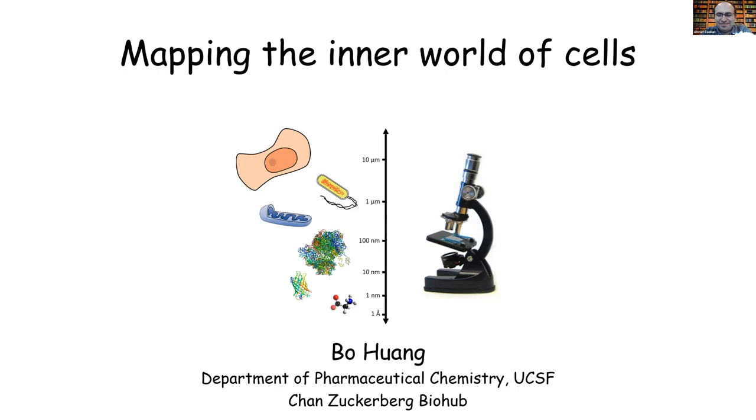That would be exciting. I actually have a number of questions, and the first one is related to what Ame asked. How do we do multiplexing? I'm thinking it's probably a very naive question, but can you design something like a reconfigurable GFP? You can control which one lights up, and you can quench it and then light up again. That might give you multiple rounds of imaging without harsh chemical processing. Oh, that would be my dream.